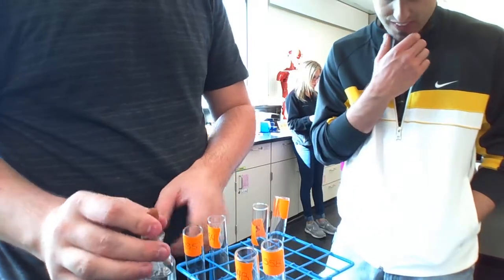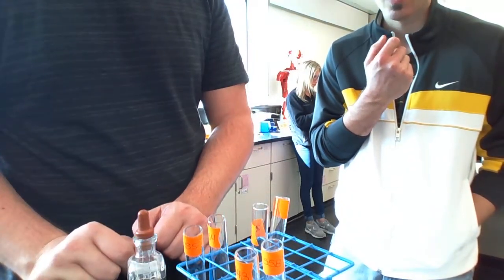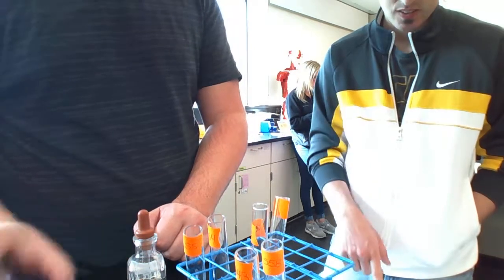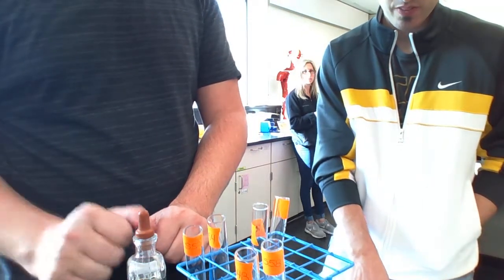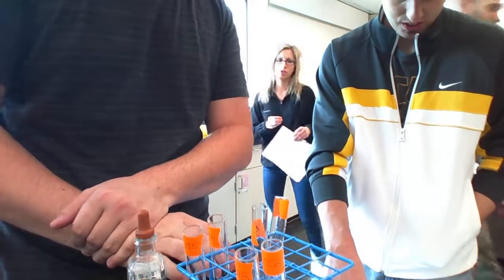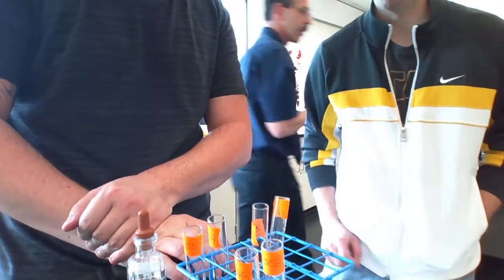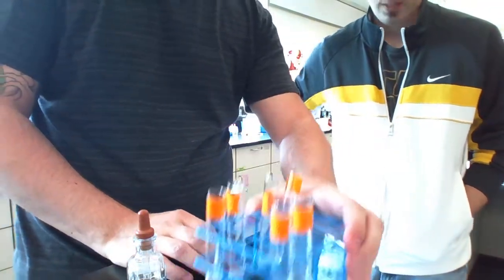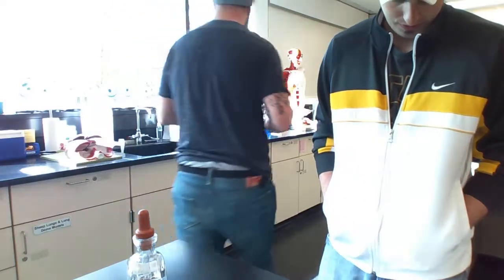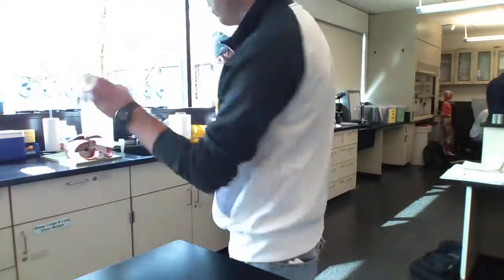Do we need 2 more to do this part? So then we need the salts. Pinch of bile salts for 5B and 4B. And you added the water to tube 2?